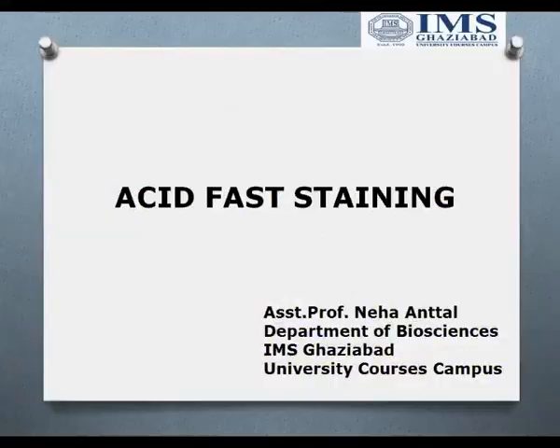Now we will continue the bacterial staining topic and take it further. Now we will study acid fast staining. What is acid fast staining? It is a special staining as it stains those bacteria which do not take simple staining.